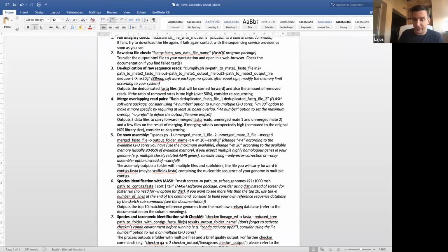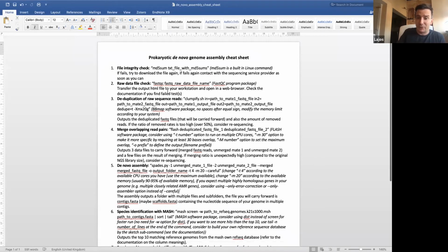Basically the main choice is between de novo and realignment. Then on Thursday, we will go through a complete realignment pipeline. I think we only have the chance to go through a prokaryotic realignment pipeline. Maybe I will create something like this for eukaryotic as well. The problem is that going through the eukaryotic one takes too much time. It's very, very long.